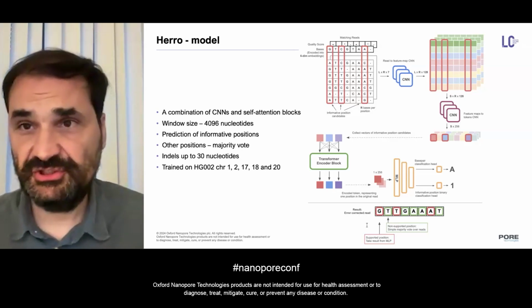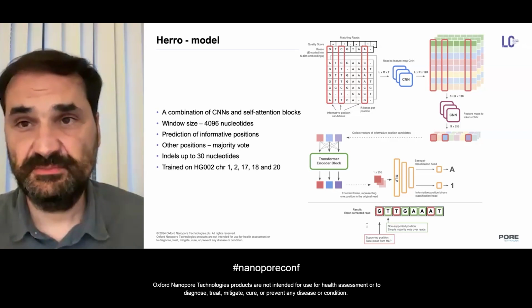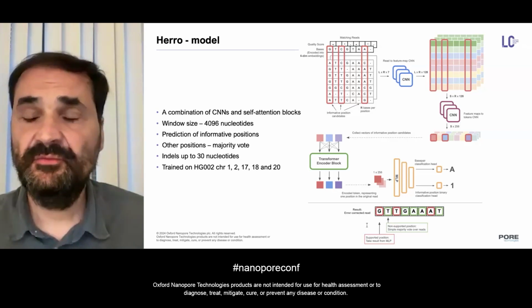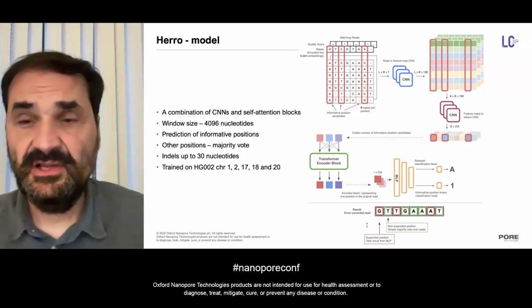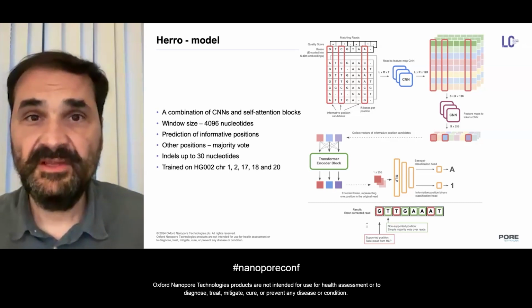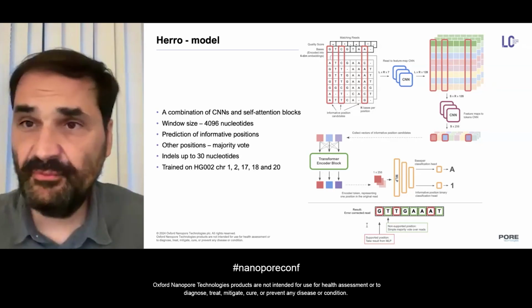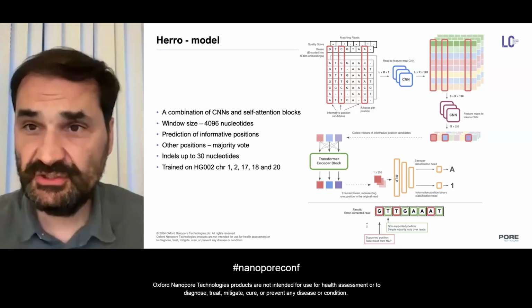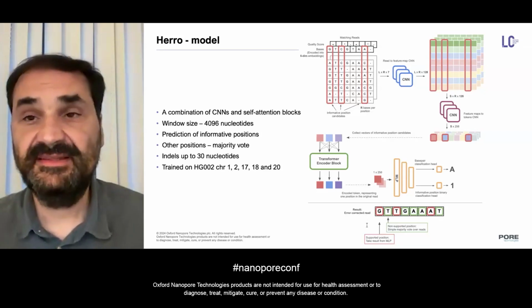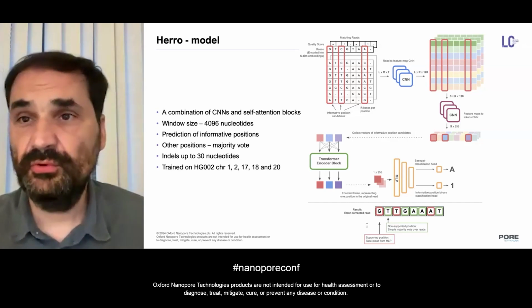For each position in a read, we see alignments to this position, and we try to find positions that could be potentially informative. How do we define them? The potential informative positions are those positions that have, for example, two types of nucleotides supported at these positions, and for each of them, we should have at least 3 or more reads that support that position.